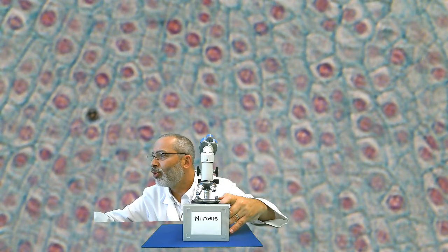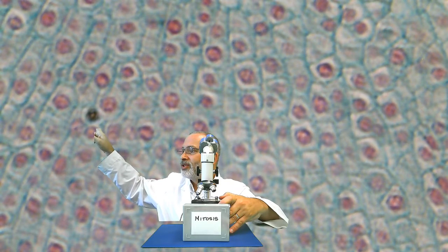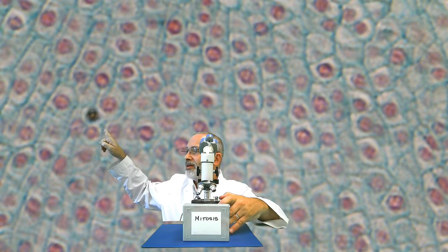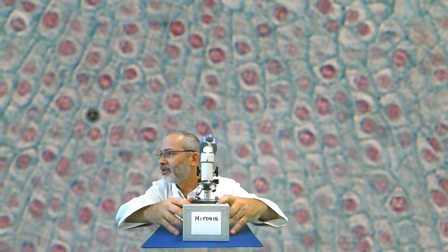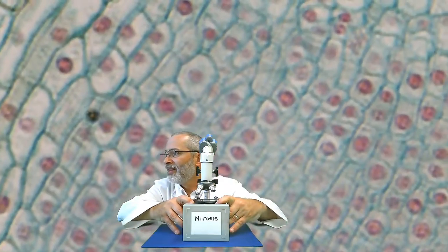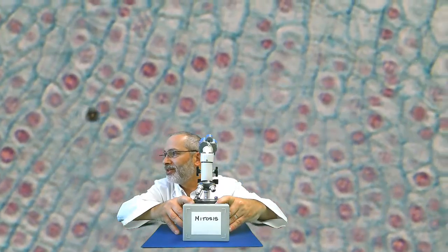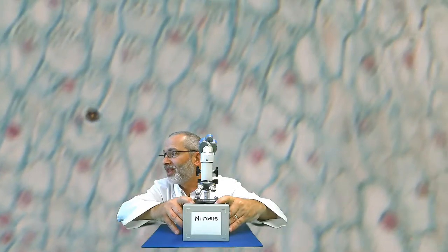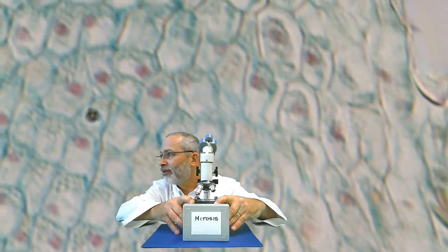I can't use a pointer at this point in time. Oh wait, here we go. I can use my finger. See that dark area right there at the end of my fingertip? That's just a smudge on the lens. I wasn't able to get it off. Maybe next time I'll get it off. So you can know that because as you move the slide around, that little smudge stays put. So that little smudge is not part of the slide itself. It's a little speck of dust on the microscope.